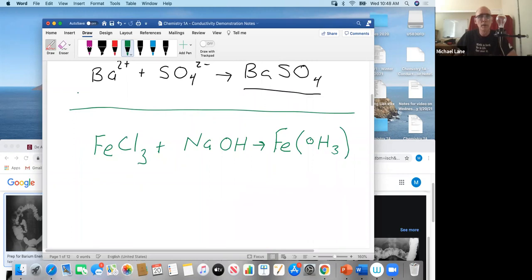Oops, shame on me. I, of course, had that wrong, because the 3 goes on the outside so that there's 3 of them and sodium chloride. And now I'm going to come back and demonstrate this one.